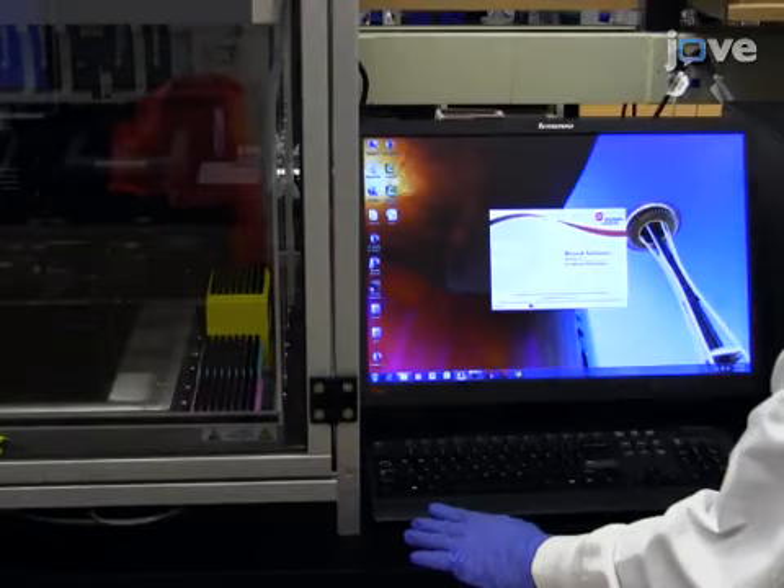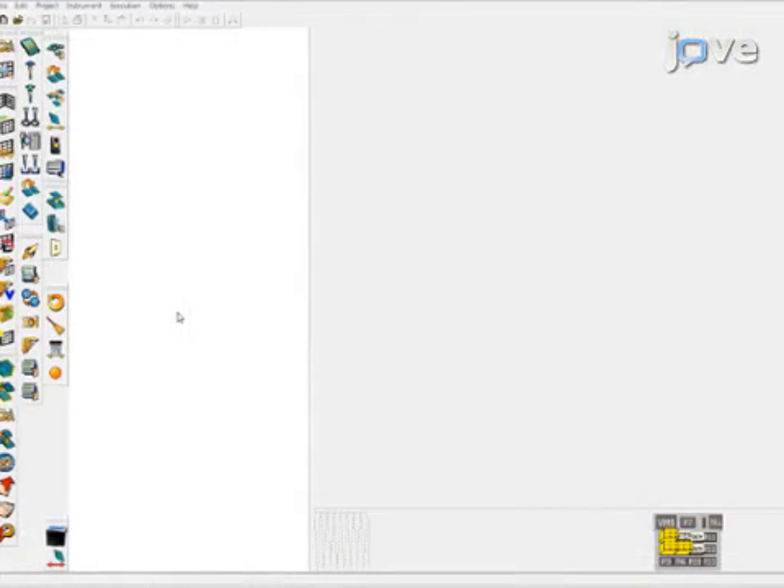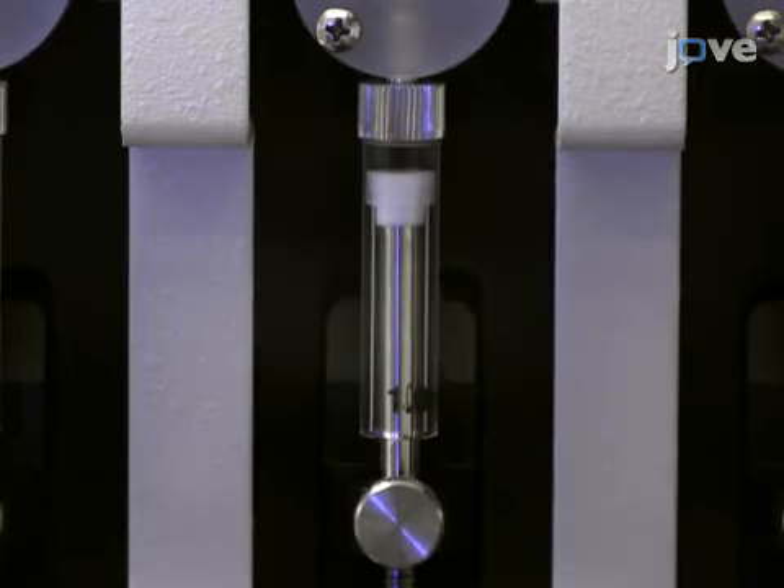Now launch the 2D barcode reader, and then the automated liquid handler. To prime the syringes of the automated liquid handler, under Instrument, select Home All Axes. Confirm that none of the syringes contain visible air bubbles.